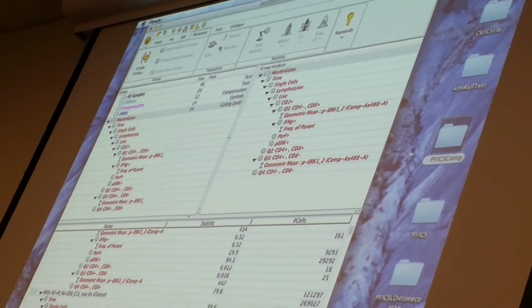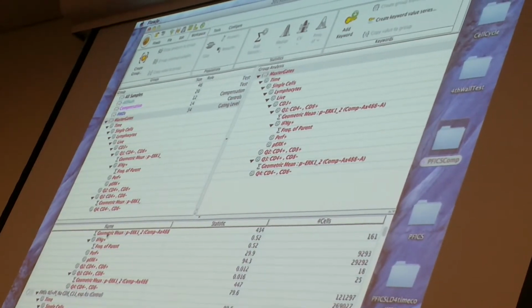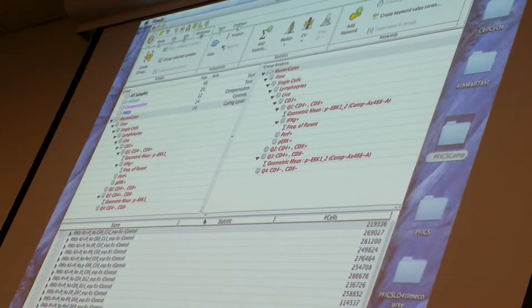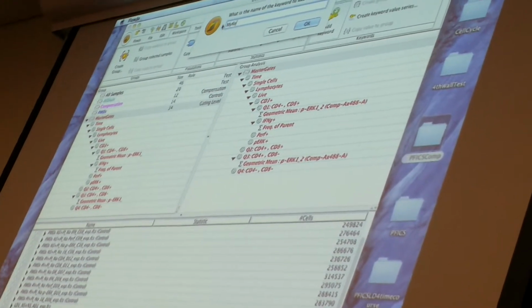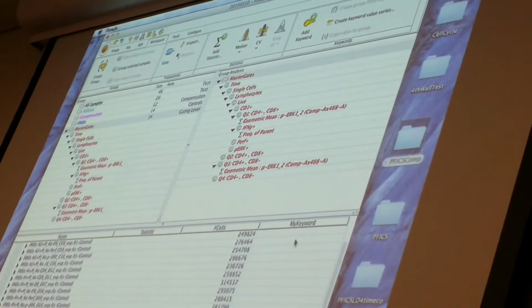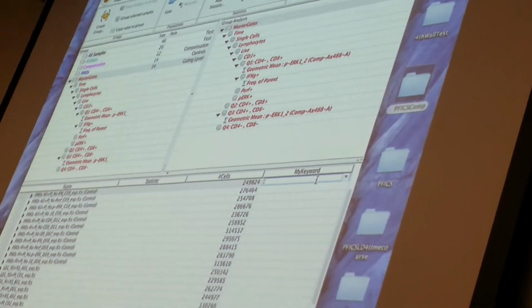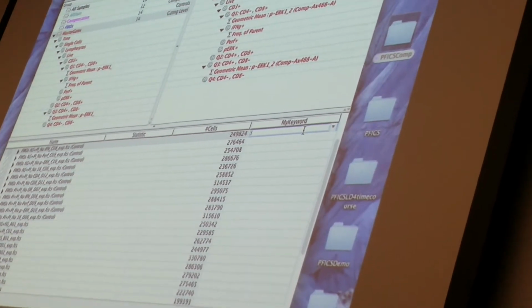I mentioned keywords here. Right now I've got the statistic, which is by default the frequency of parent, or whatever I put in there, the geometric mean of phospho-ERK. That's all these. But maybe I want to add some more keywords to organize these data. So I can add a keyword in FlowJo, New Keyword, right here. Give it any name I want, maybe my keyword. And when I press OK, I have a new list that I can then type my keyword information into, and I can sort by that keyword information. I can also use those keywords to make a group inclusion criteria in my groups.